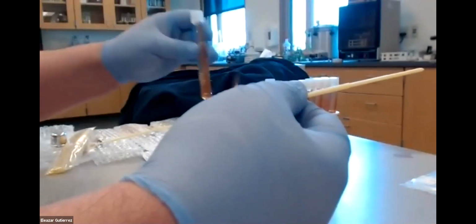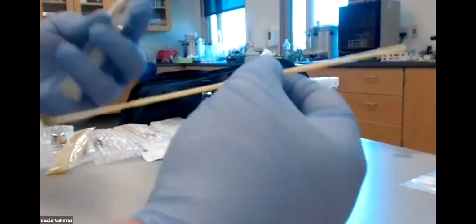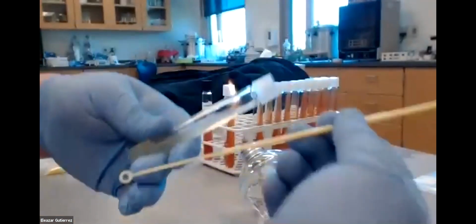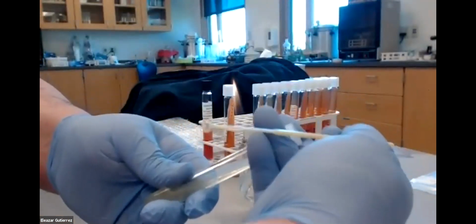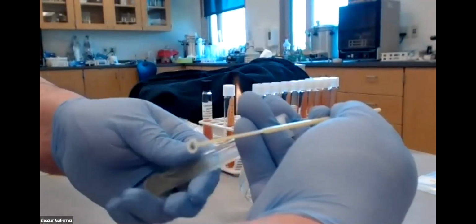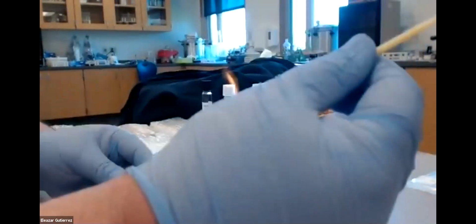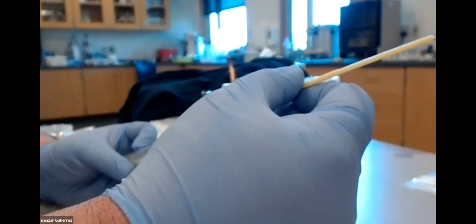Okay. Now, that's one. We have to do it again. Okay. So I'm going to grab my E. coli again. There's my E. coli. I'm going to grab it with the back of my hand. I'm going to take the cap off. I'm going to flame it. 1, 2, 3. I'm going to grab another inoculum from it.